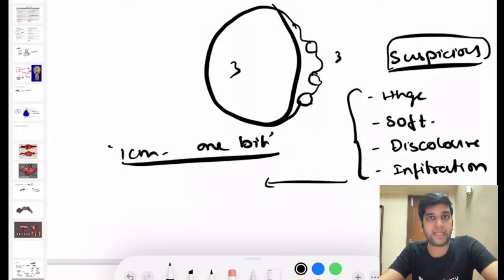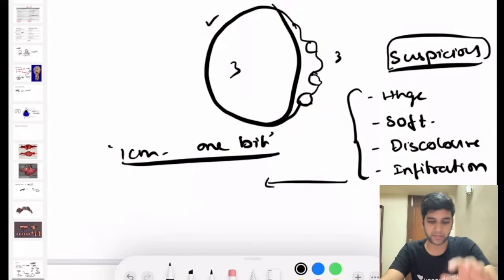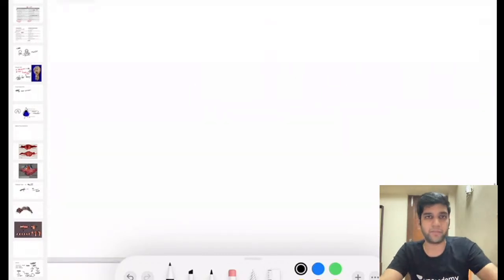And if you feel after looking at the microscopy, okay, there is something not good for me, anytime you can go and regross. Sometimes grossly it may be completely normal, microscopy it might look abnormal, that time I'm definitely going to go and regross it, right? So these are for your myomectomy specimens, right? And we know about the uterus benign lesions.